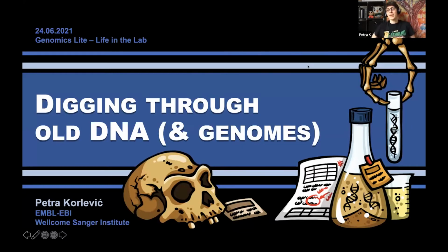I was keeping an eye on the chat and the questions, and I do like that some do connect to this talk. Michelle very nicely explained what you do if you have what I would call the perfect samples. They're freshly caught, they're stored immediately in perfect conditions, and you get nice whole chromosomes out of them.